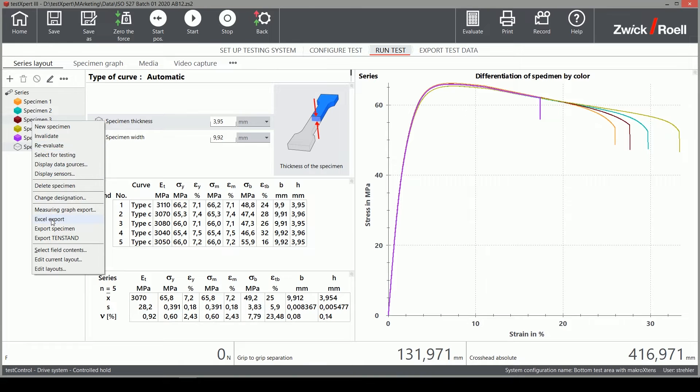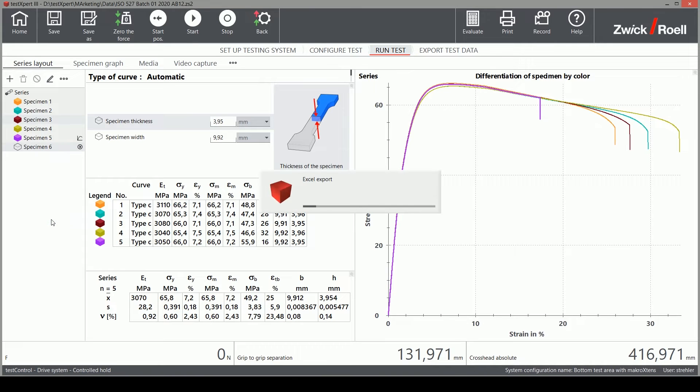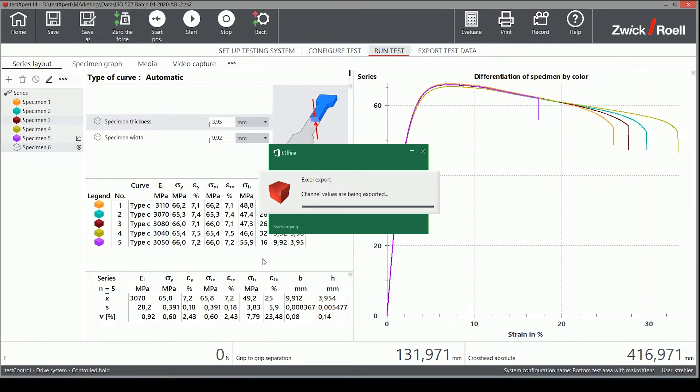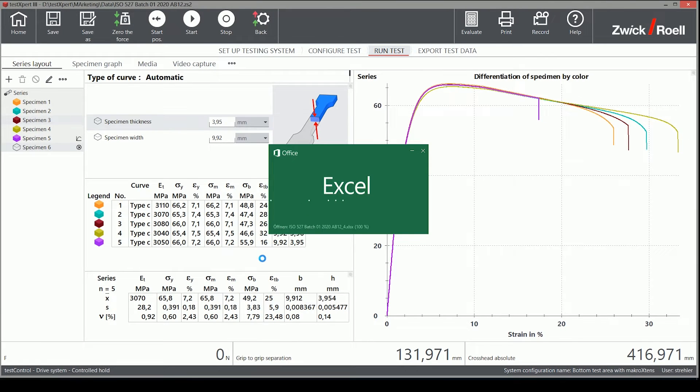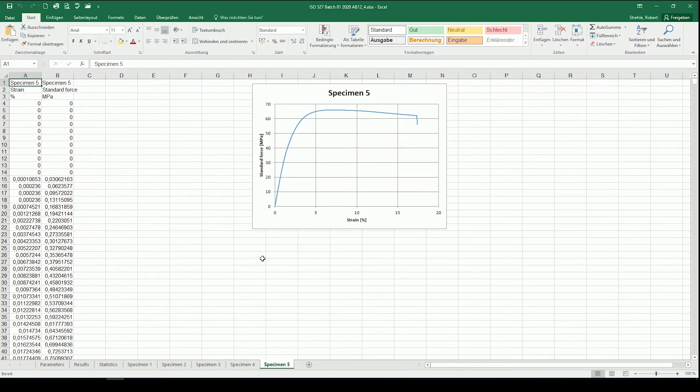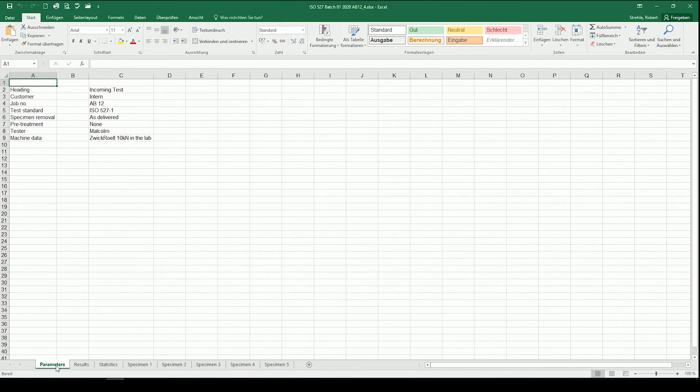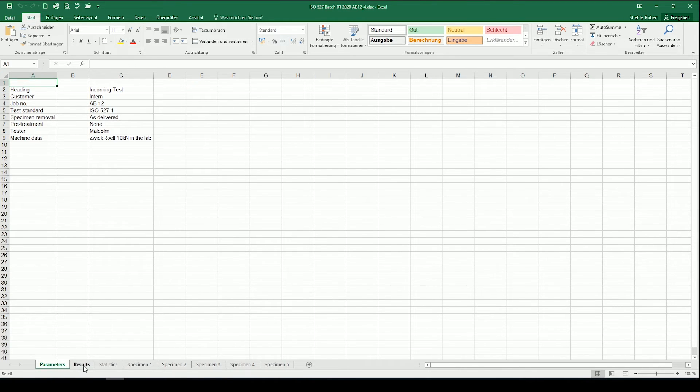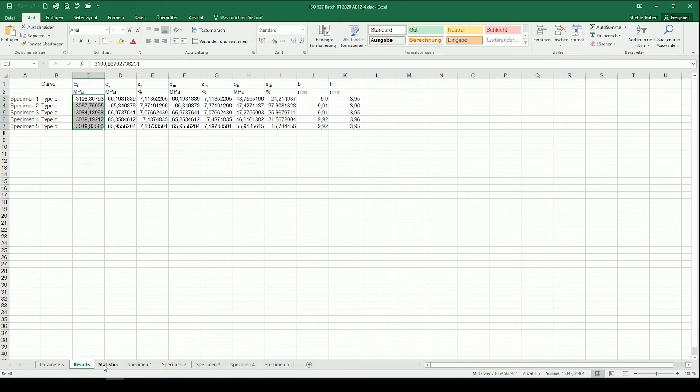With just one click, the export is complete. All test results, test parameters, and selected raw data are exported to Excel automatically. There is one file with all the data nicely separated into different worksheets. This is exactly what my boss wants to have.